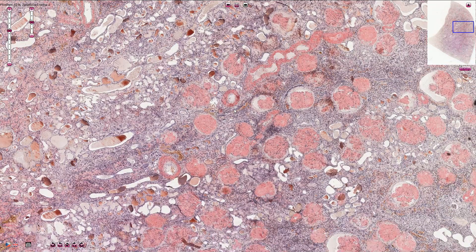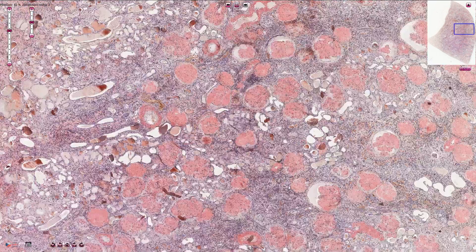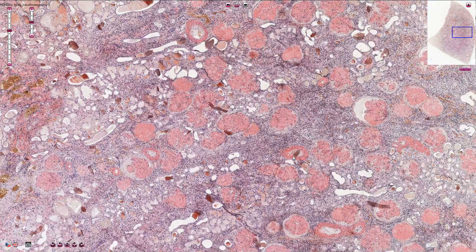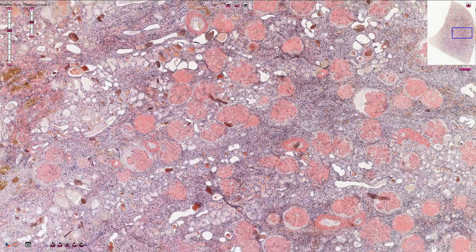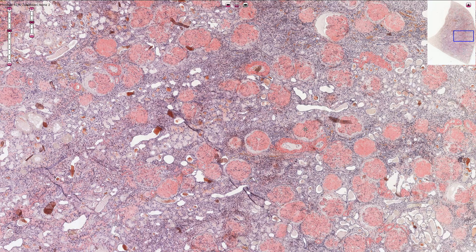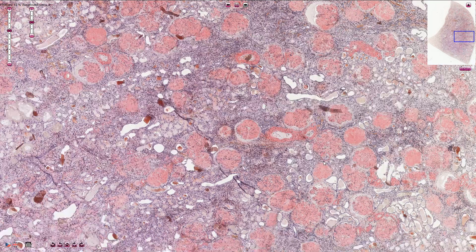If we use a polarized filter, this amyloid would turn from red into green — also called apple green. This phenomenon is called apple green birefringence, and that is the proof that we are really looking at amyloid and not some other protein.